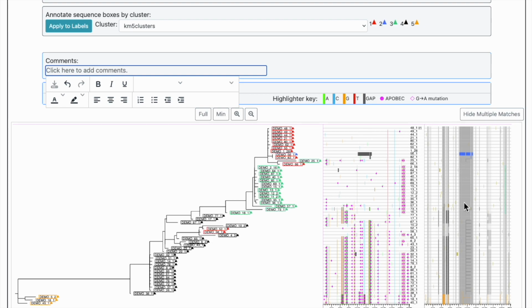This plot only appeared once I had assigned lineages, and it shows variation in these sequences relative to the assigned lineages. One of the things you might notice is that there are colors in here that correspond to the colors that we've used for the lineages. So there's a gold and a black and a blue color. There's also a lot that is highlighted gray. We can see a green color over here.